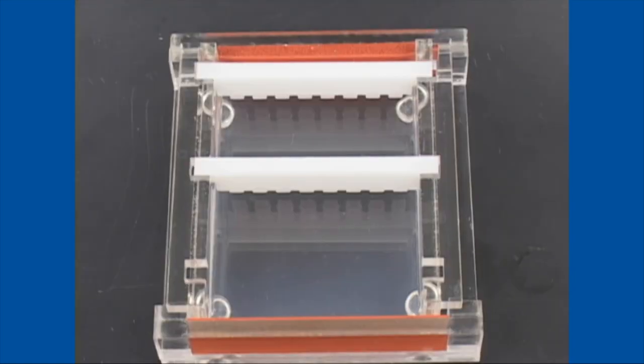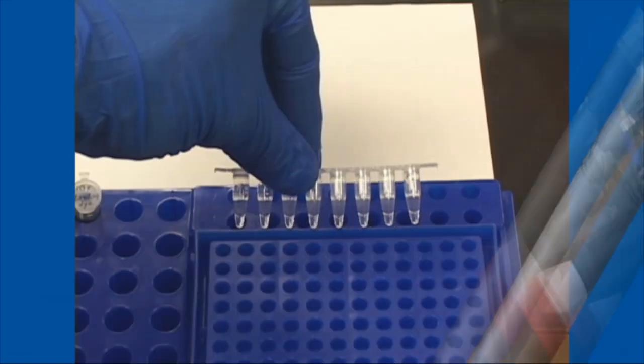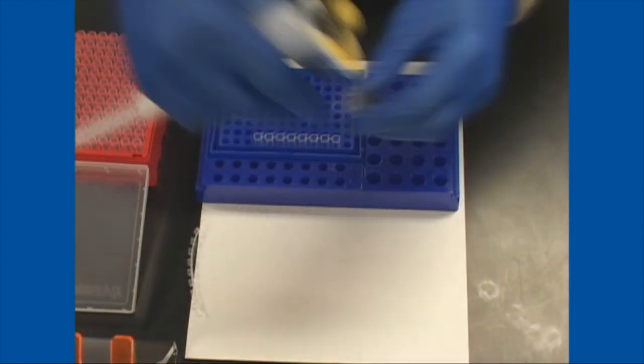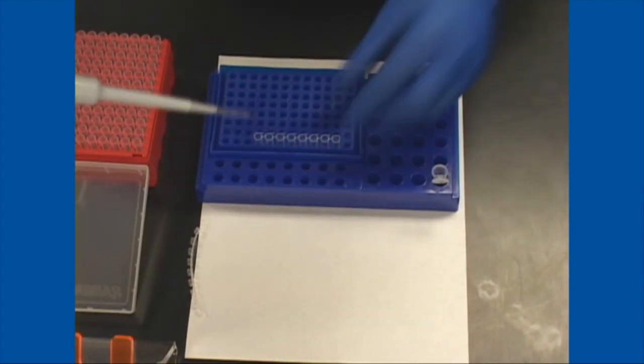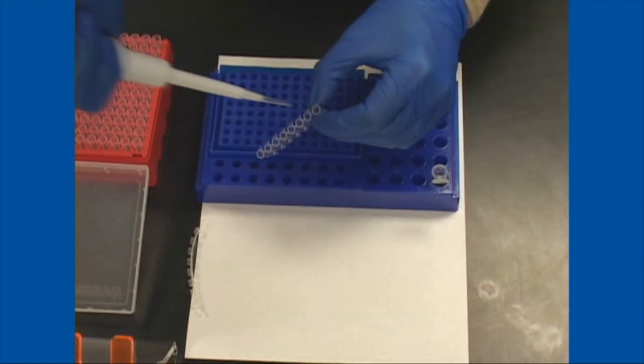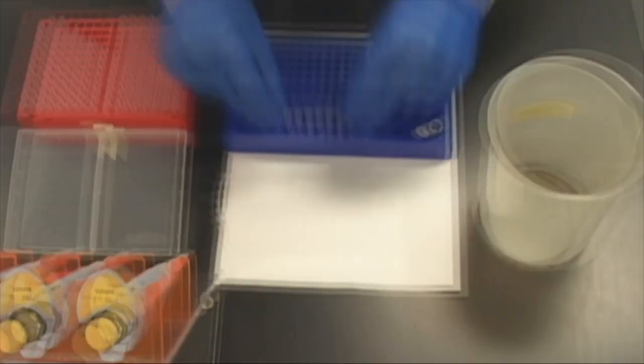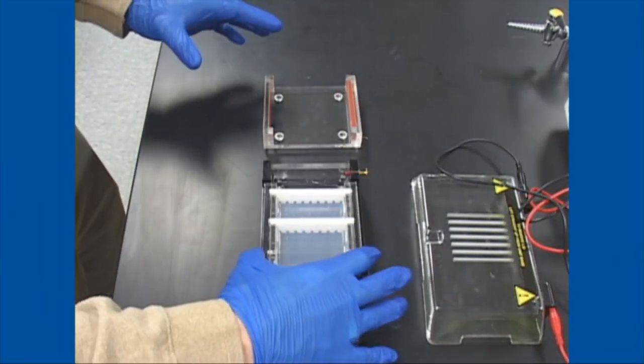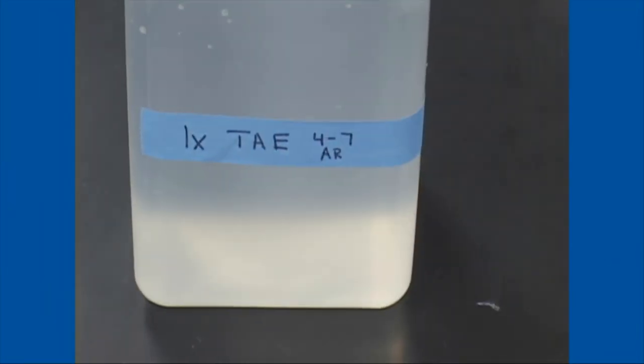Typically these are found in 10x or 6x formations. They contain weighting agents, which are typically Ficoll, Glycerol, or Sucrose. They also contain a dye or a couple of dyes that allow you to monitor the electrophoresis process.